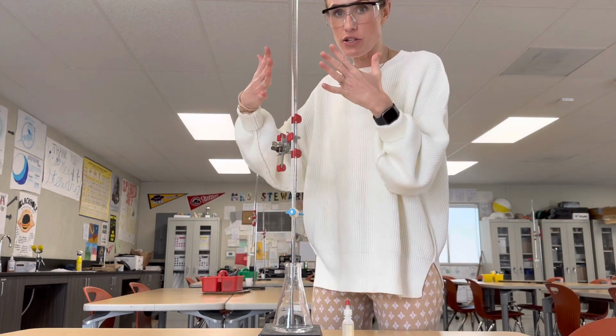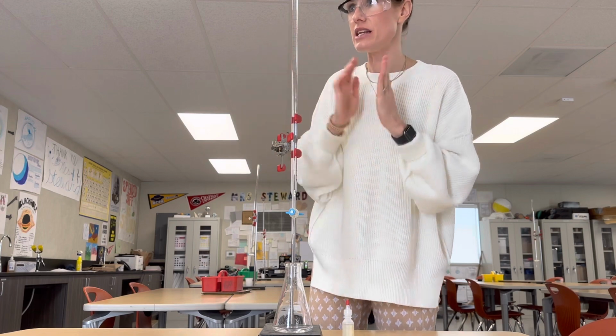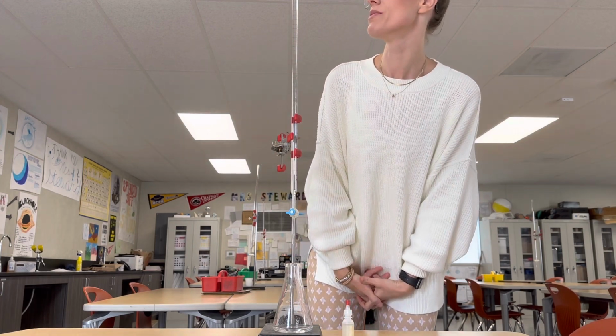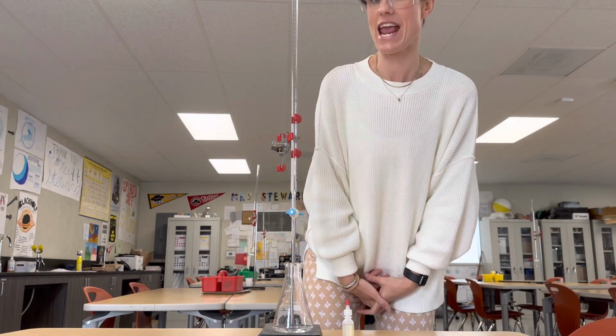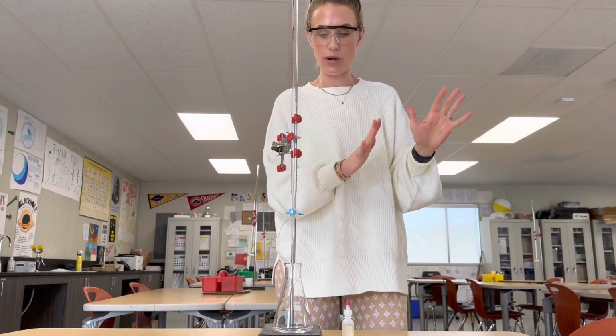So I have my sodium hydroxide in my burette here. So that's my base. And the initial volume of sodium hydroxide looks to be about 5.8 milliliters. So that's one of the things that you're going to have to put into your lab report.